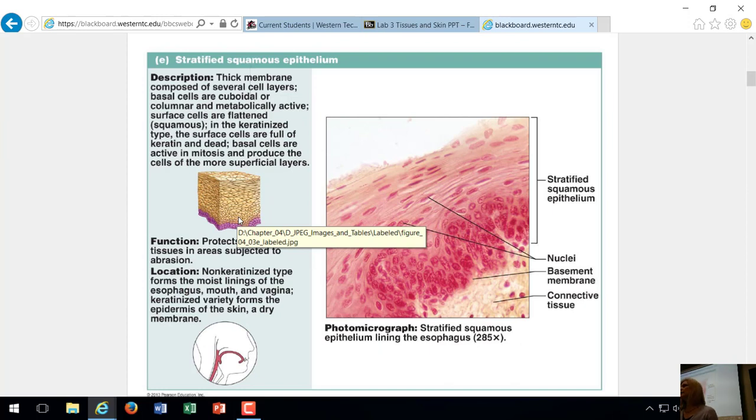That's the stratified part of this. And again, it's an epithelial tissue is how we classify it. All epithelial tissues either line an organ or cover an organ. They form either the inside or the outside. So it's the first tissue we see when we're going from the inside or outside of an organ. In this case, it's on the outside making up our skin.